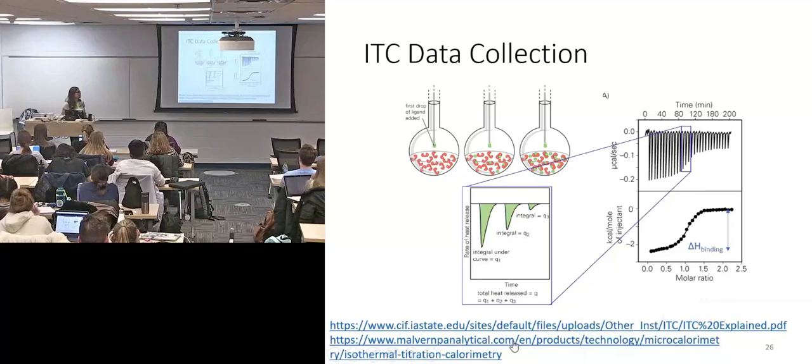These are two separate resources, an ITC explainer, and then this is a company that's trying to sell you a calorimeter, but it has a nice little description of how ITC works. I recommend reading both of these. They do a really nice job of explaining the process of ITC in more detail than the couple-minute version I'm giving.